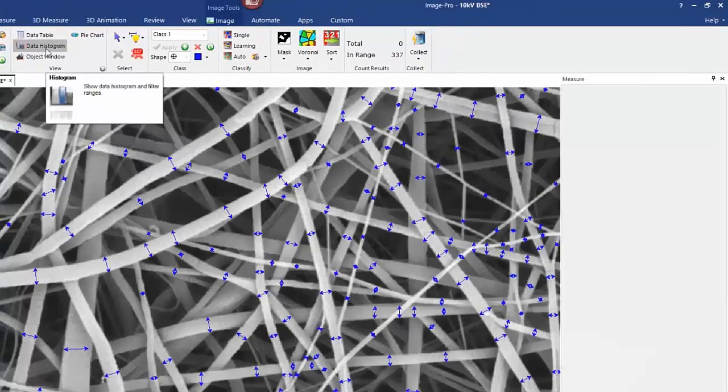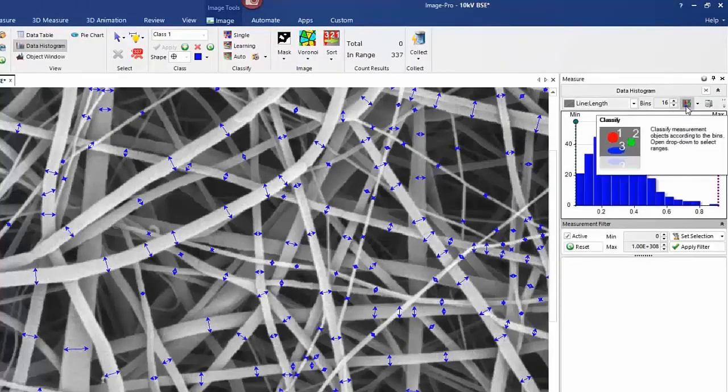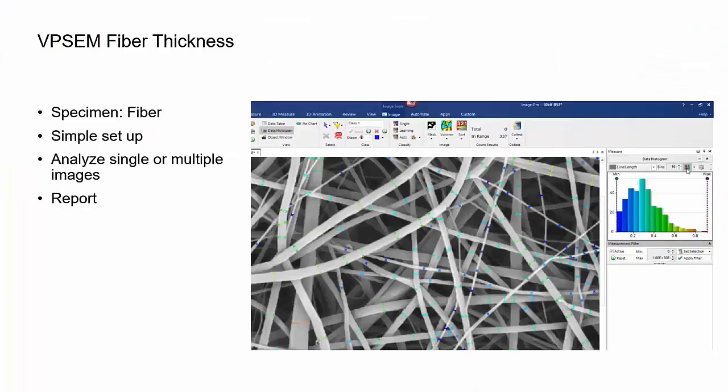This will also report fiber orientation. Again, with the various displays as you're characterizing your manufactured materials, you can then come in and take a little bit of a deeper analysis about those materials and their characteristics, from the manufacturing process and then doing the QA. Next slide.